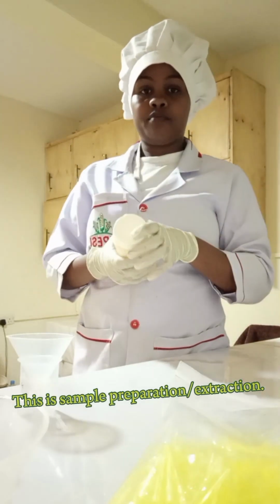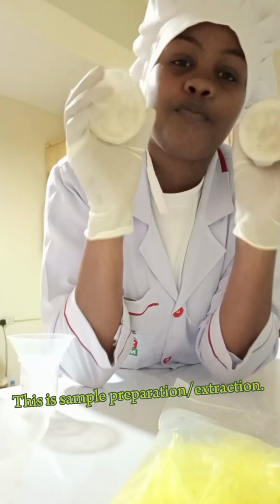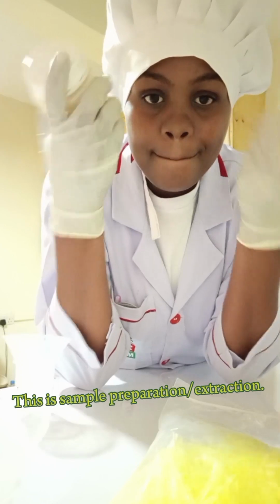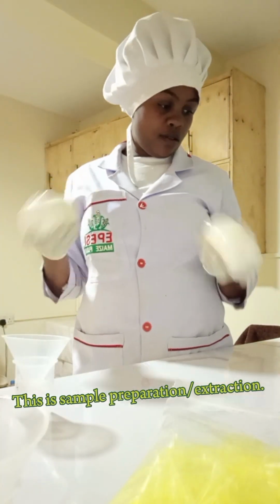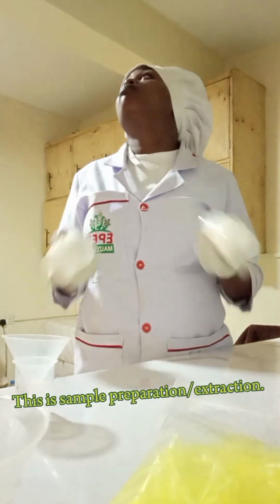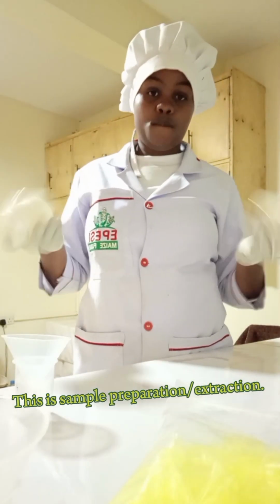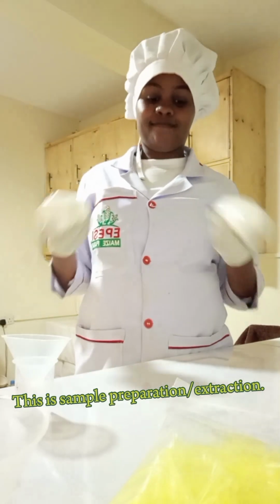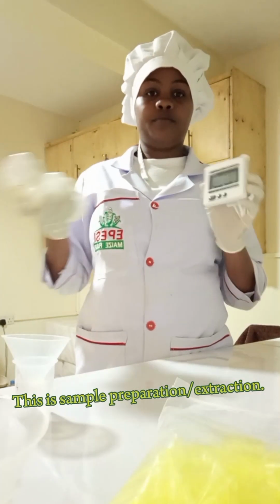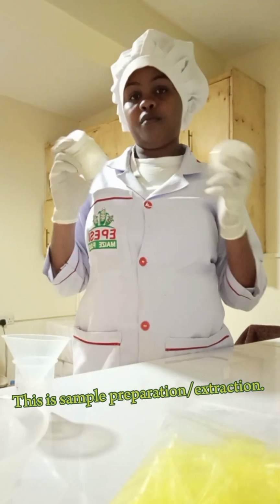I'm just doing the procedure, but explaining the real thing that happens. Maybe I'll do it in another video. At this stage I was doing the sample extraction preparation. When you receive the raw materials you sample, and then you go to the lab, you grind or crush it if it's maize, so that you can obtain fine particles. You mix with a certain percentage of a certain liquid. I'll mention it in another video.